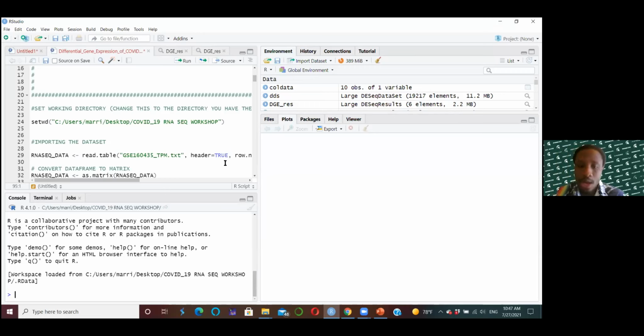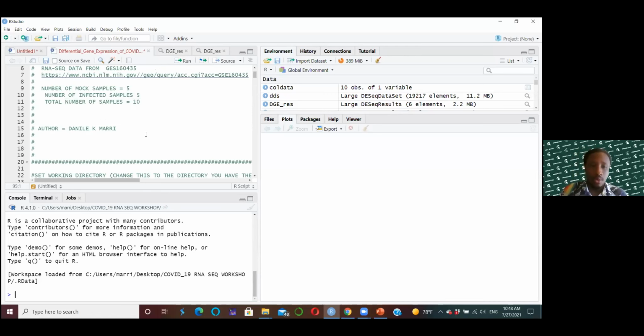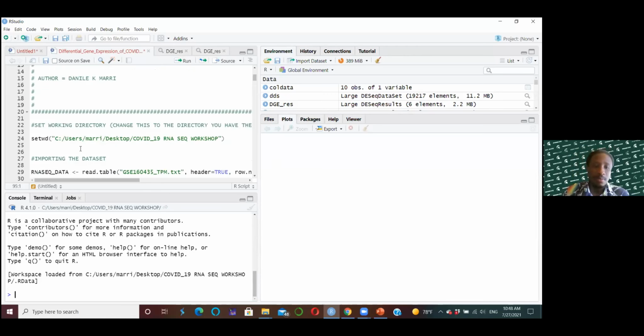I hope we all had these resources before today. If you want to follow along, there are some packages and installments that you need to do, which were provided in the documents that I sent. We sent out the email to all the applicants who registered, so it's been taken care of. Okay, thank you. Then let's move on.